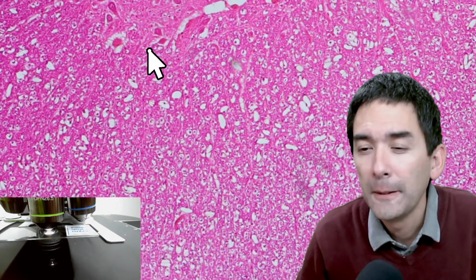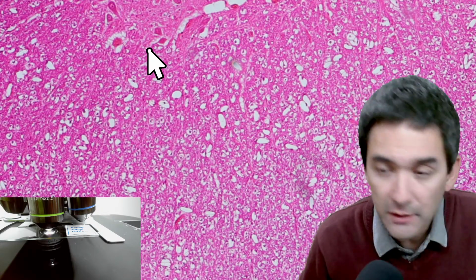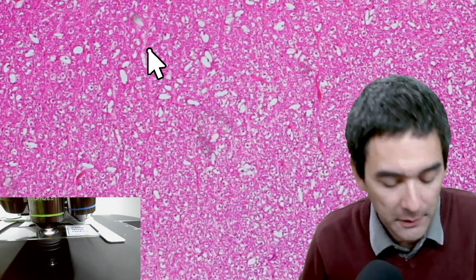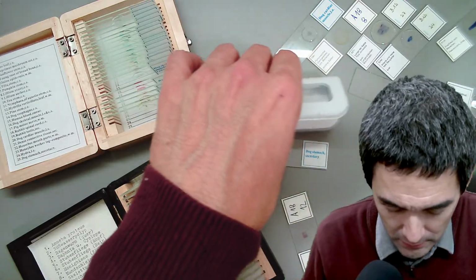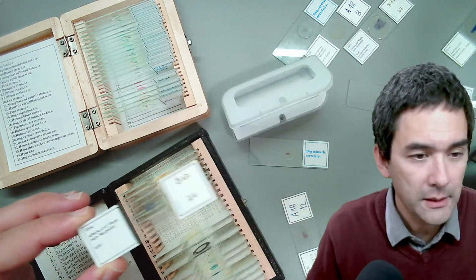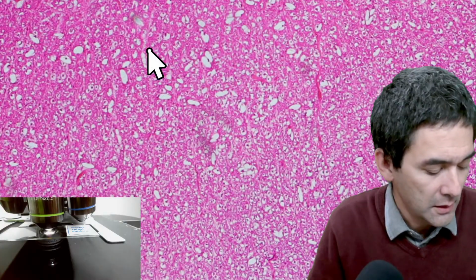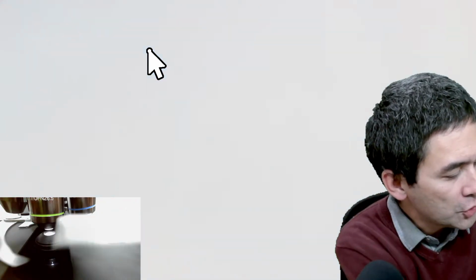How to identify blood vessels? Well, arteries and veins. I don't know if you joined later, but I actually did show you a slide, if I can find it over here. It's one of the artery and veins of a mammal. Okay, here it is. It doesn't say which mammal, but that's the one that I just showed you before.